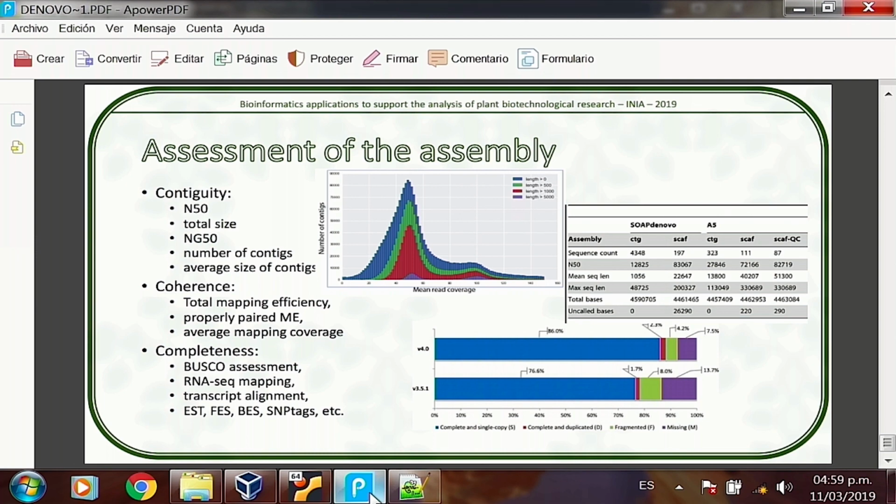So once we align the reads back to the genome, we start checking how well these reads align to my reference genome. And what should we expect? First thing, if the assembly is good, I expect that most of the reads that I used as input should be found in the assembly, because those reads are the raw material that the assembler used to build the assembly.